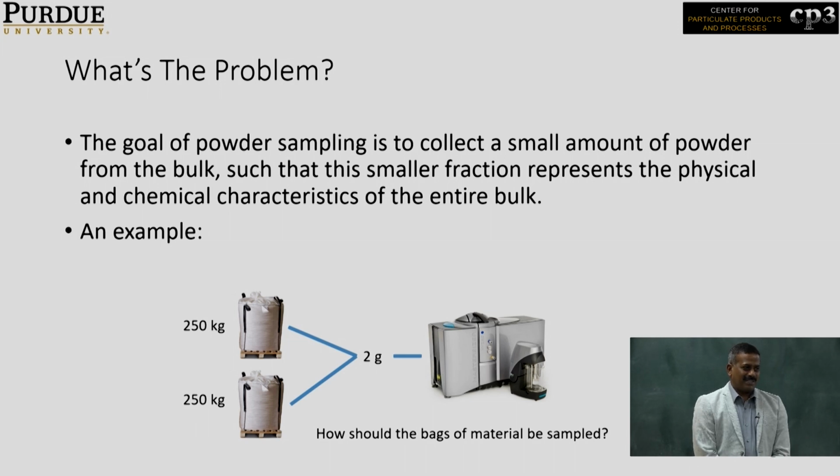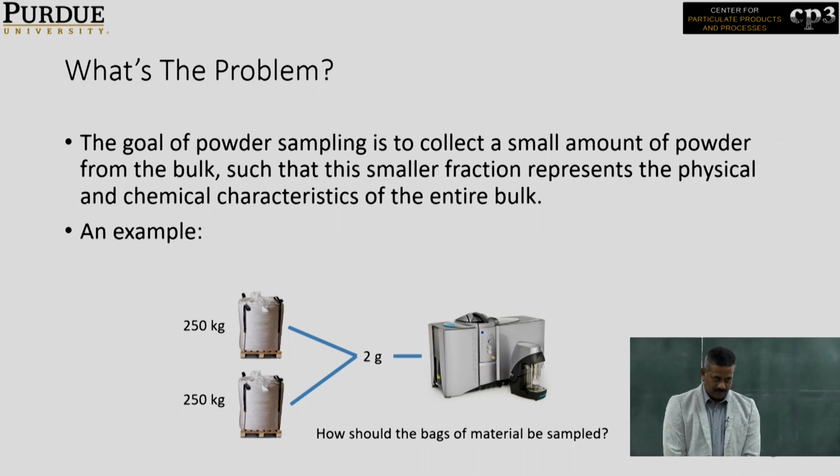Mixing will be a little difficult, right? Okay, you can take 1 gram for each. Okay, but how will you take that 1 gram? Maybe at different positions.